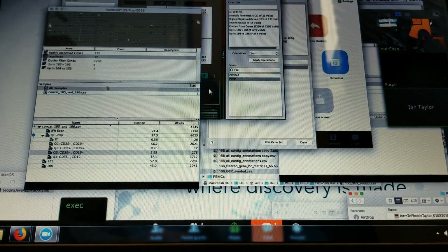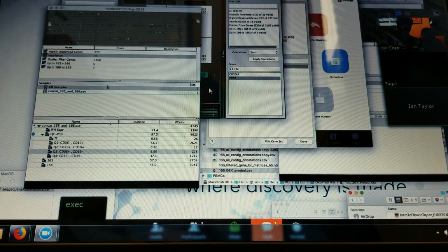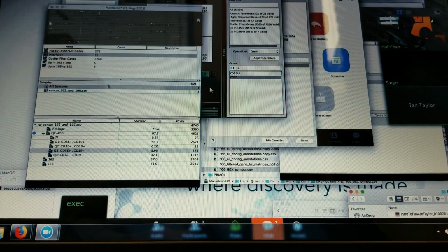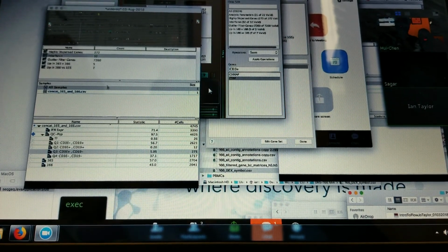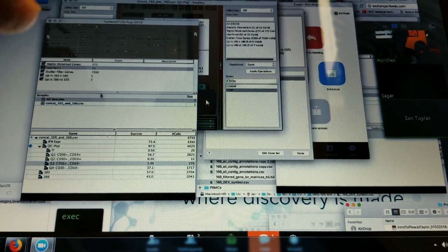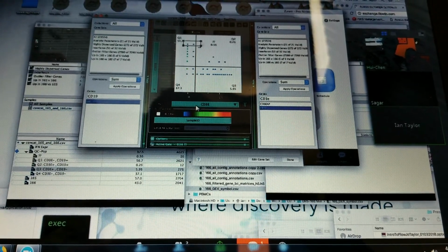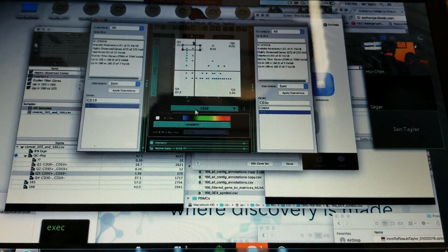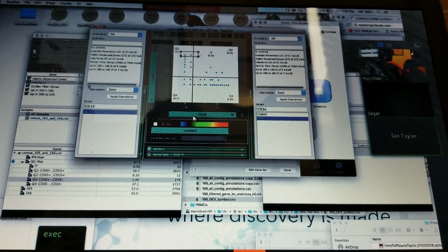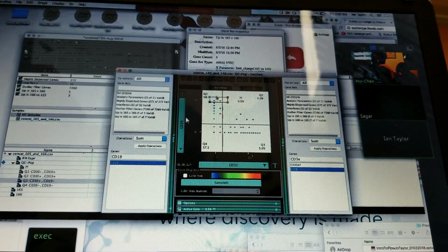Right, and then so you did the right, I see the gene sets. But this new thing you just did not. Like the gating you did just now, CD19 positive, it did not show up in the gene set area. Right, because we're in cell view. Oh, okay. So when I draw a gate in cell view, it appears as a population within a sample. And in this case, we have one, we called it just a couple of question marks here.